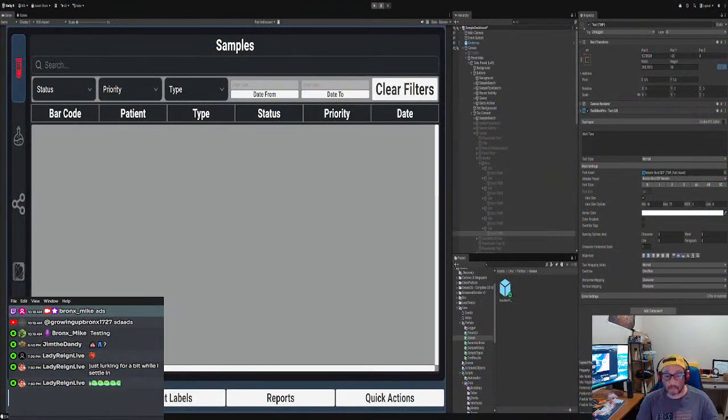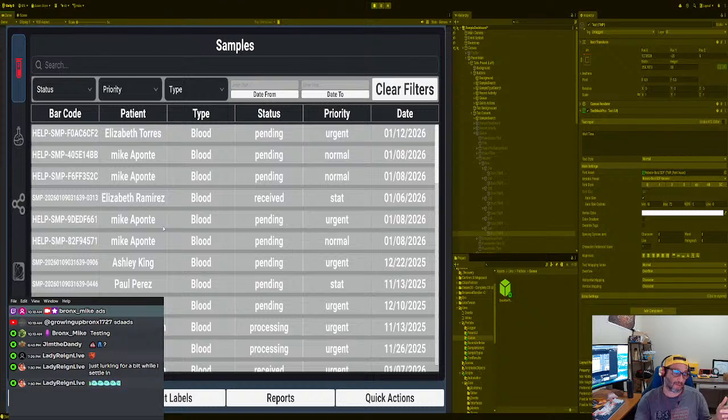All right, folks, I'm back. Okay, so far what we got are our sample views. We'll go through this real quick. Okay, look at it from the point of view of the user, right? Sorry, it was an echo. I put it on mute. Sorry about that, folks. All right, so we have a sample, right?